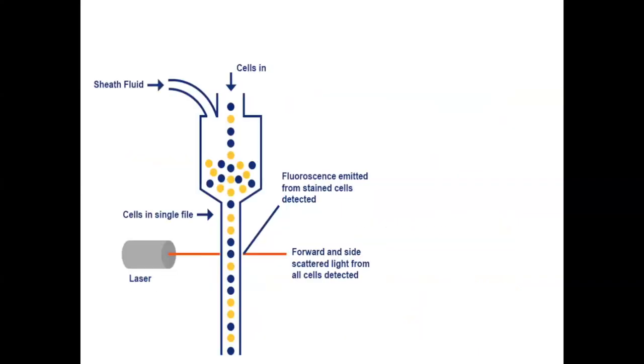Right. So now let's go. So this is what is happening. So we have cells which are stained with fluorochromes, that is antibody tagged with a fluorochrome. Okay, and as it goes in a single file pattern, I'll tell you how this is achieved. The light source, commonly a laser, hits that, and what happens? Remember, two things happen: scatter, right, which will tell you about the physical properties, the forward scatter and the side scatter. Parallelly, the fluorochrome, which is attached to the cell via the antibody, will give you signal, fluorescence emission, right? And that will be captured by the detectors.